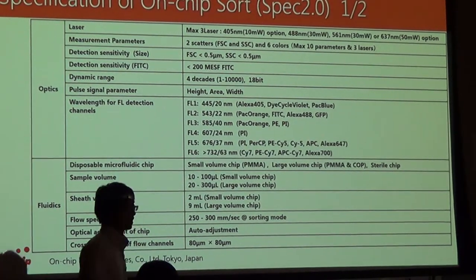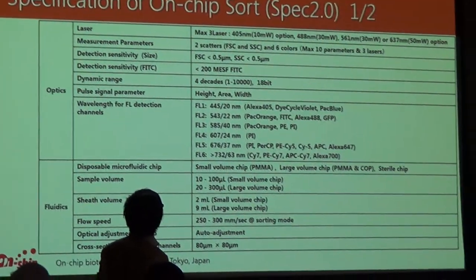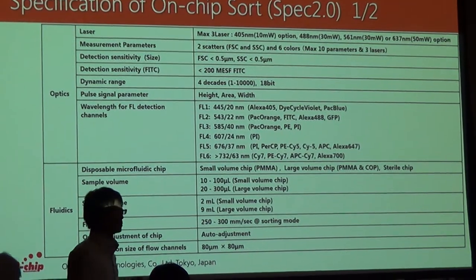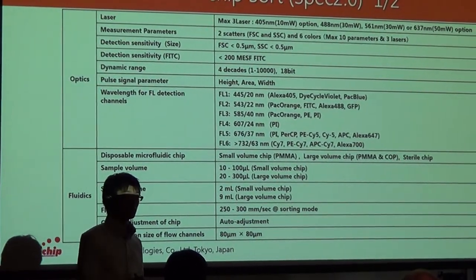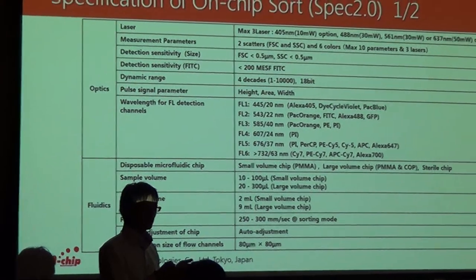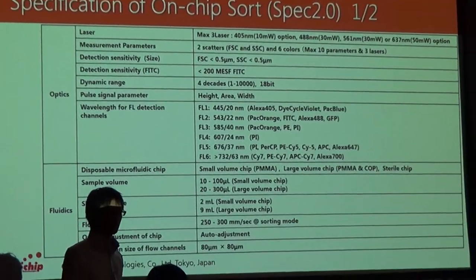And a bunch of tables with data, you don't need to focus on it too much, but a few things to point out: like I said, we can actually install up to 3 lasers as options, as you can see at the top. And the detection sensitivity I was talking about, in terms of size, you can get down to about 0.5 micrometers, which is pretty small. The largest we can comfortably sort is about 40 micrometers, because the channel that we have is 80 micrometers wide, and something about half of that width, I think we can still reliably sort. But anything bigger kind of gets tricky. We can probably get over that by having a channel that's a lot wider, and we're trying to get that done.